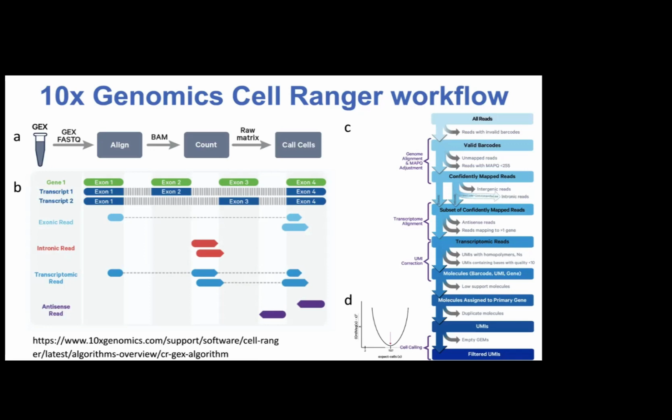Now it also looks at the UMI. The UMI sequence is 10 base pairs after the barcode. The UMI is just a random unique sequence, and you use it because you're worried that when you replicate the library, you skew towards one read that just gets multiplied over and over again.